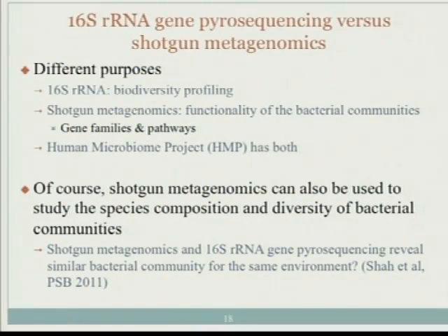As I said, there will be different types of algorithms for the computational approach to these two problems. If you want to figure out who is there, or what they do, you will work with different data. Probably you'll need different algorithms for these two different purposes.